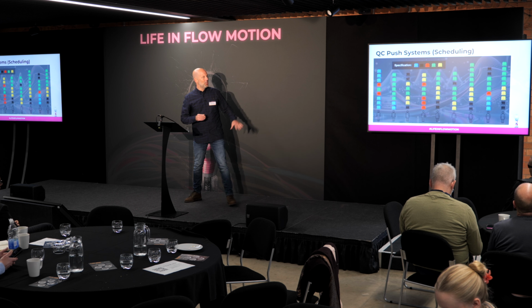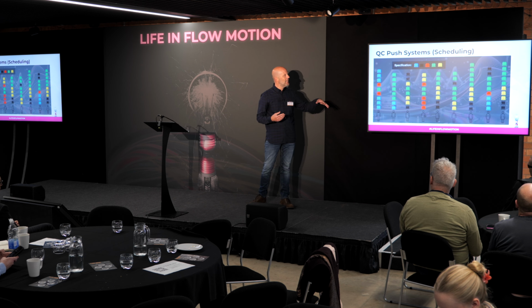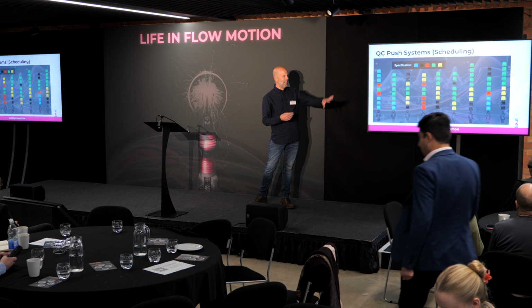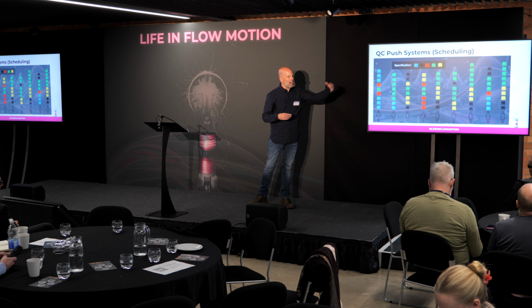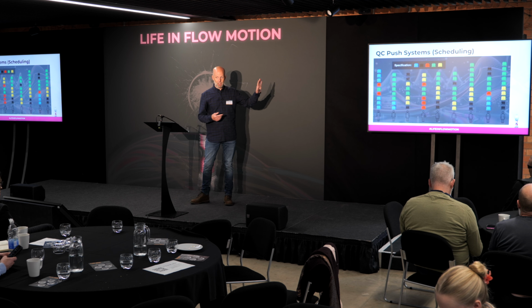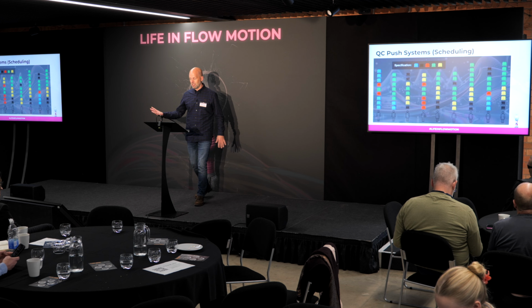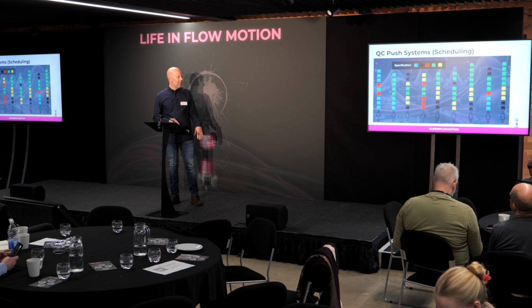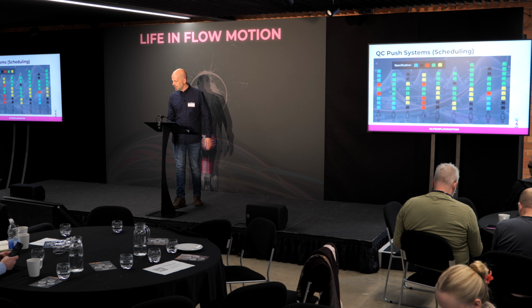And as a boss, you want to see everyone busy. You don't want people sat around. And also as a boss, if an urgent thing comes in, I feel really important because I've intervened and prioritised some work. I've done the prioritisation. And there are lots and lots of digital options for how to schedule work. You can Google anything and there are lots of very expensive digital options that will push the work into a QC lab.